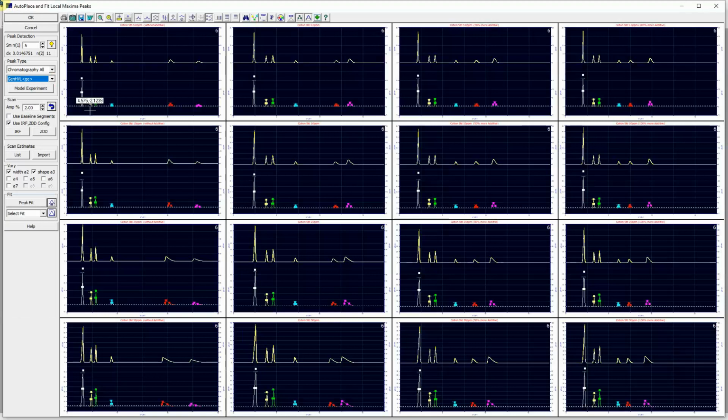This is our go-to model since it offers third moment asymmetry in the core density, allowing us to fit the HVL, NLC, and a variety of other shapes. And the GEIRF is a general one that includes one probabilistic component, a half Gaussian, and a kinetic component, a first order exponential. This model is likely to manage most non-gradient analytic peaks in virtually every type of chromatographic data, including HPLC and UHPLC, quite well. It's our recommended point for fitting analytic peaks.